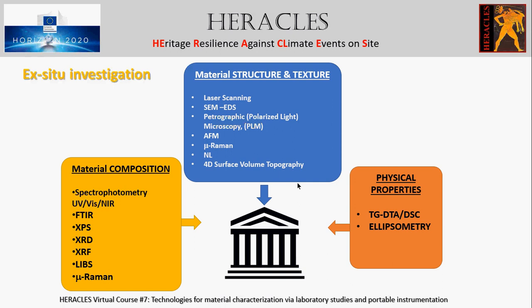The energy dispersive spectrometry gives chemical element information complementary to other techniques such as X-ray diffraction, X-ray fluorescence, and X-ray photoelectron spectroscopy, with the advantage of results are on the observed spot. Although in the literature this technique is considered non-destructive, the sample recuperation is not compatible with other techniques.